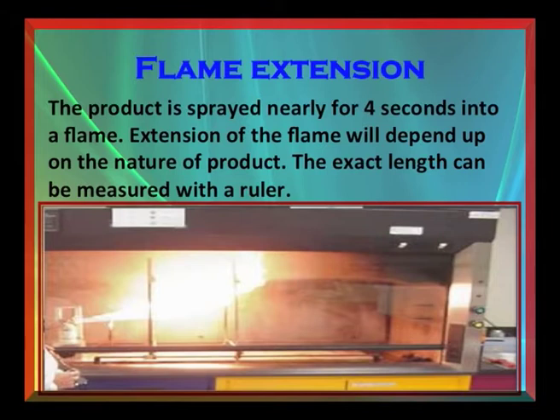Now another parameter, that is flame extension. It helps to indicate the effect of an aerosol product on the extension of an open flame. The product is sprayed for nearly 4 seconds into a flame. Extension of the flame will depend upon the nature of the product.